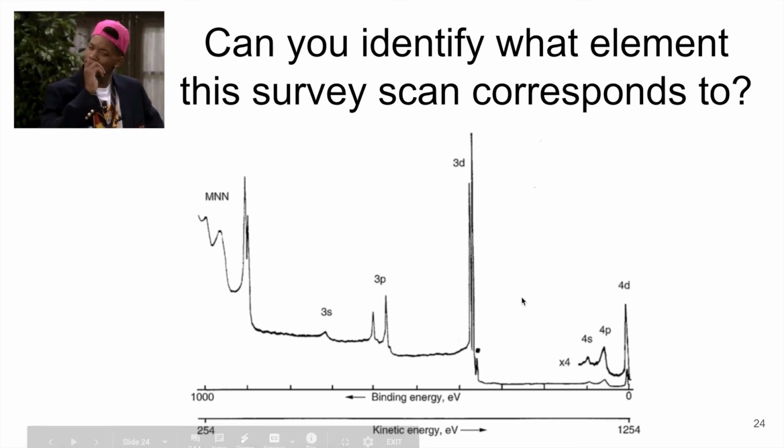And this is just one element. So we only have one element. We're not looking at multiple elements here. So this is a scan for a pure sample. What sample is this? Pause the video, see if you can determine this. We'll come back and discuss.